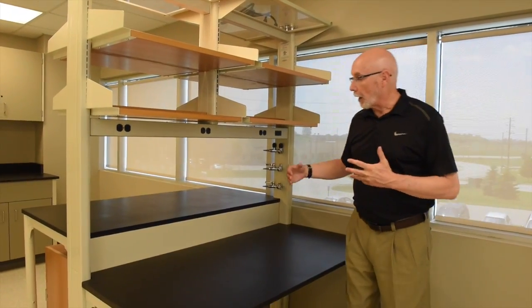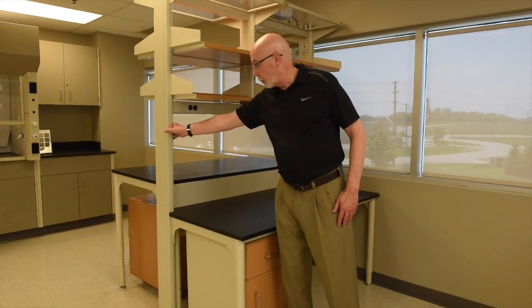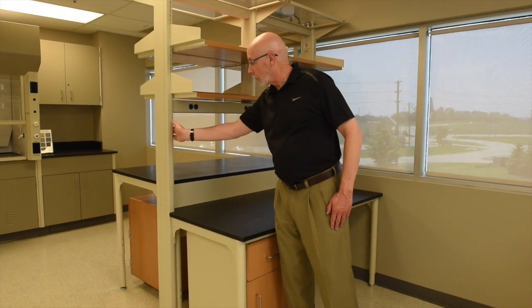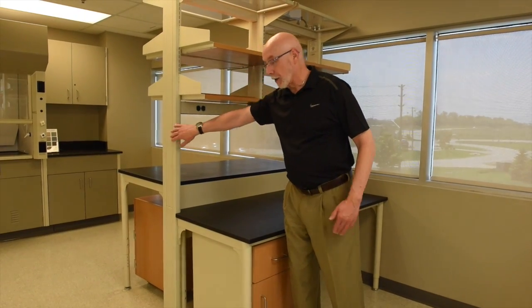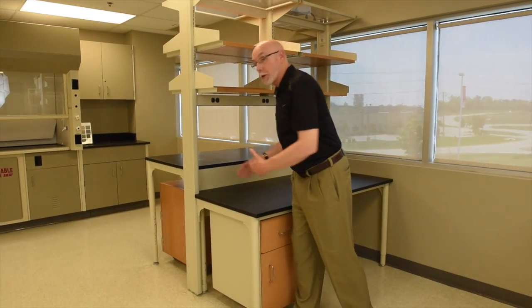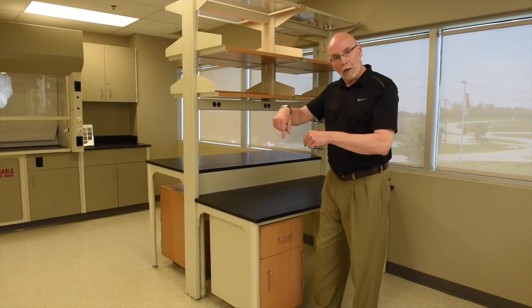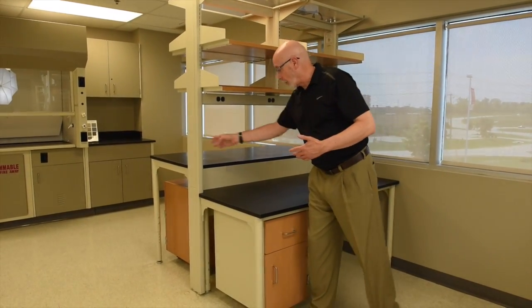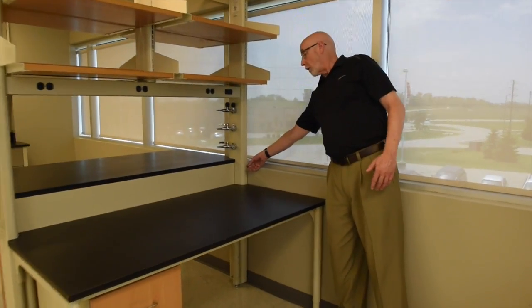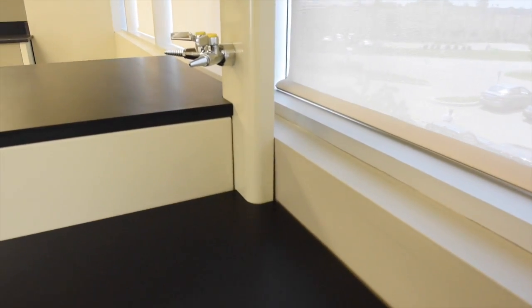You'll notice that the post here is what we call a D-profile post. It's nice and soft and curved on the inside, and then it's flat on the other side. When you put units together and the two flat pieces go together, it's nice and clean — it doesn't have that little eddy in there that you get from some of the round shapes. If you come and take a look here, you can see what it looks like in a wall condition. It is a nice, neat detail.